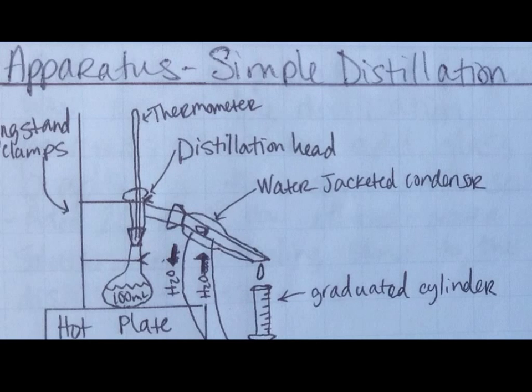And that should get the alcohol to move into its vapor state, and it's going to move out and down. As it's moving down the water-jacketed condenser, the purpose of this is water is being pumped in through the double-walled layer, and as water is being pumped in, it's going to chill the vapor, and the vapor will then recondense, forming a liquid, and then it can be collected in the graduated cylinder.